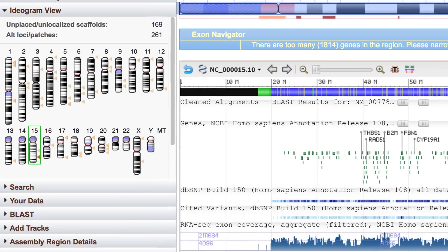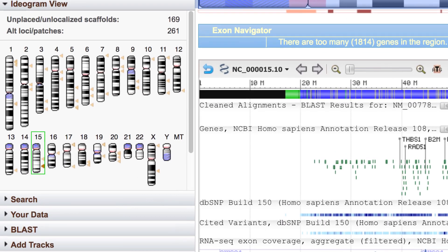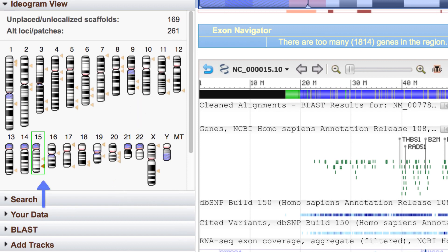The GDV ideogram shows you the distribution of BLAST hits across the genome. Notice the arrowheads — the best alignment is represented by the darkest arrowhead, in this case on chromosome 15, which is the alignment that I selected in the BLAST results.